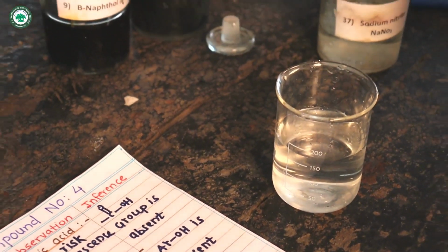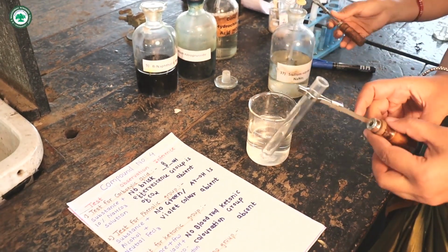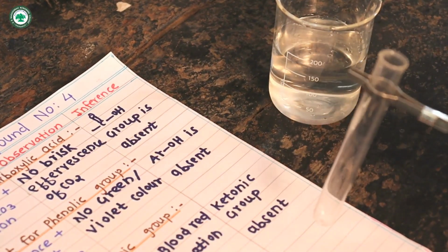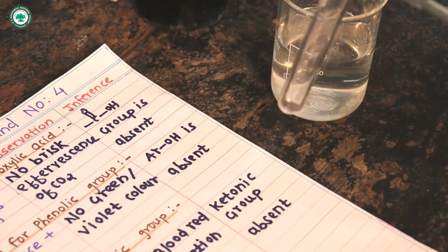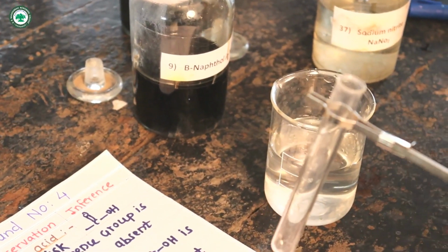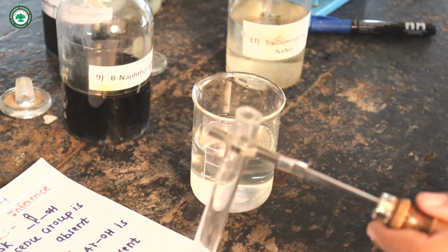Then take the second test tube with the test tube holder, take beta naphthol in NaOH.